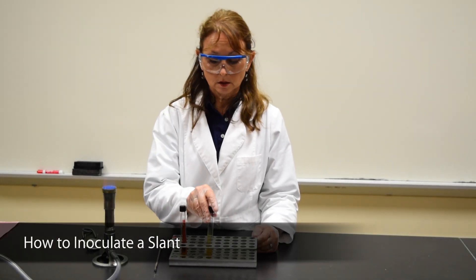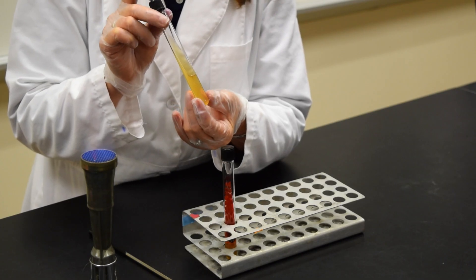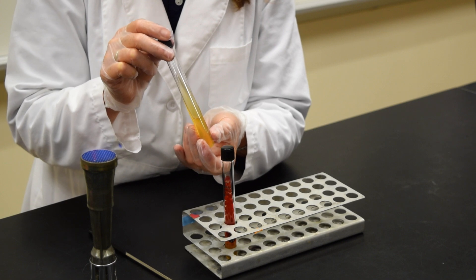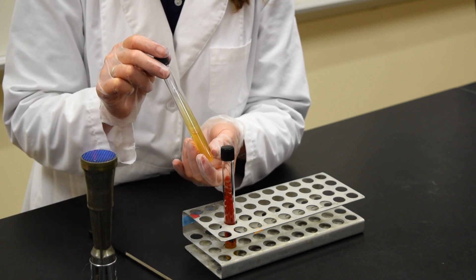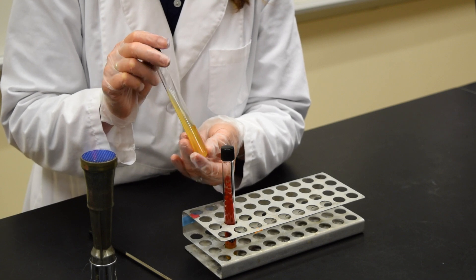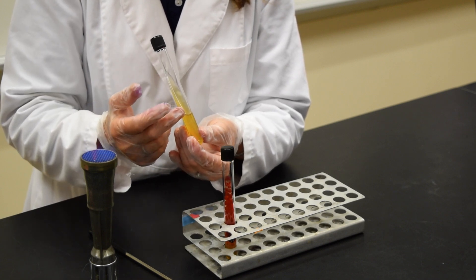This demonstration is to show you how to inoculate a slant. A slant is culture media that contains agar that's placed in a tube that has a screw cap. The culture media is autoclaved. When it comes out of the autoclave, it's placed on boards so that it solidifies and we have a slanted surface.